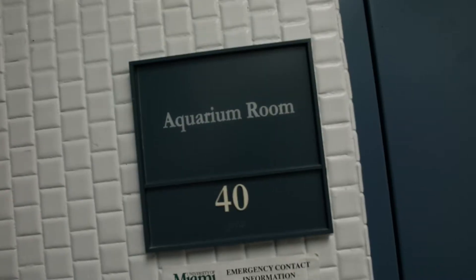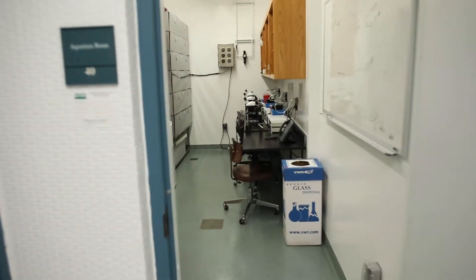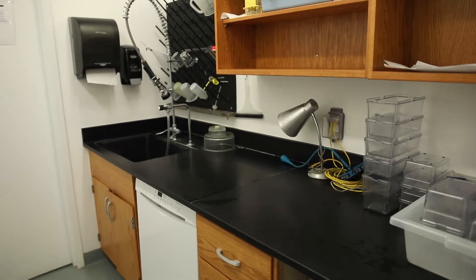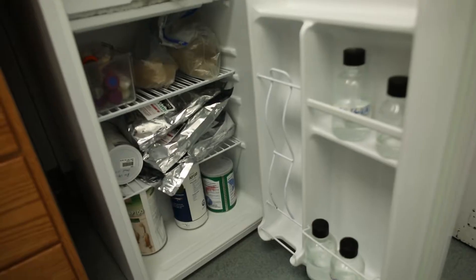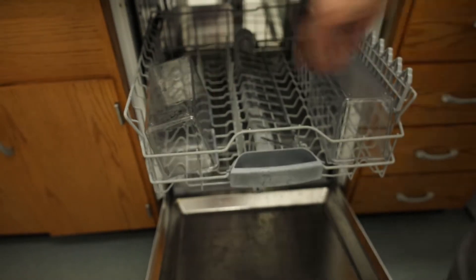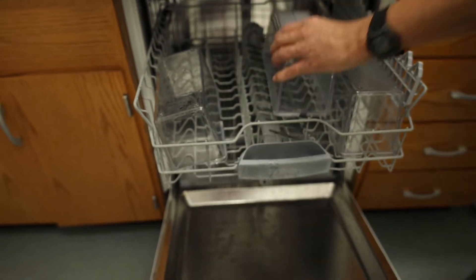There is a main aquarium room and six associated rooms: one for micro-injection with three micro-injection stations, and one room where we manually test the water parameters and prepare and store the fish food. This room also has a dishwasher for cleaning crossing tanks with hot water and bleach.